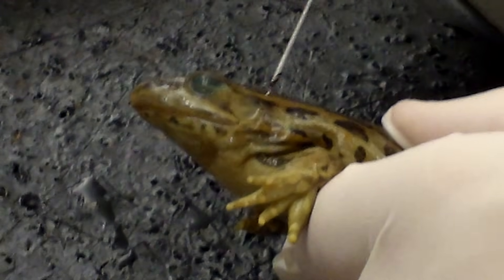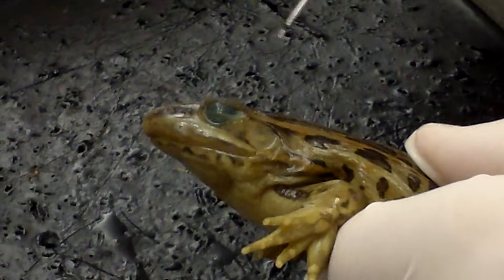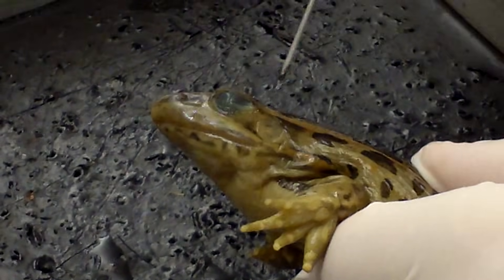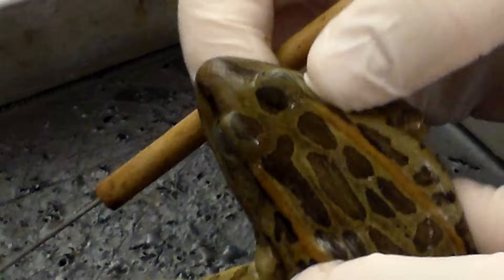Frogs also have a tympanum. This is a membrane that's equivalent to our eardrum and this is how frogs hear. You can push around it and see that there's an opening in the skull where the frog is able to hear sounds — it's an external eardrum.